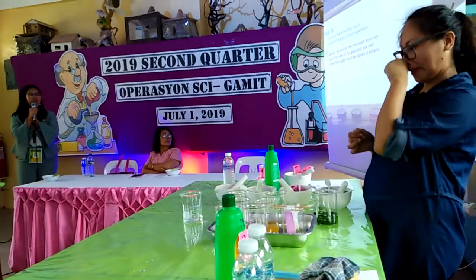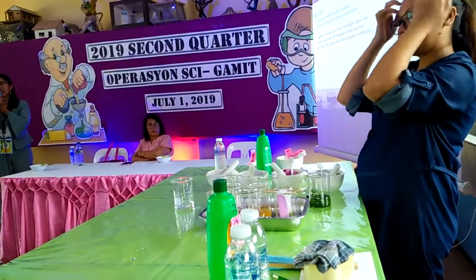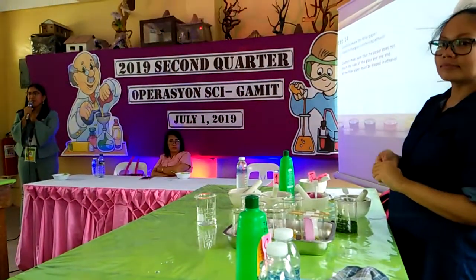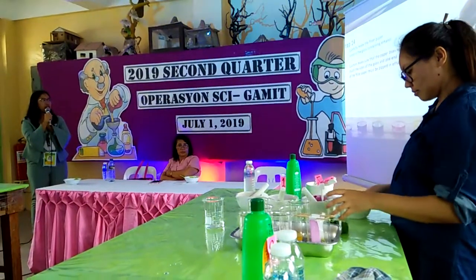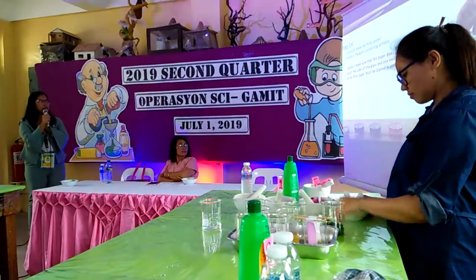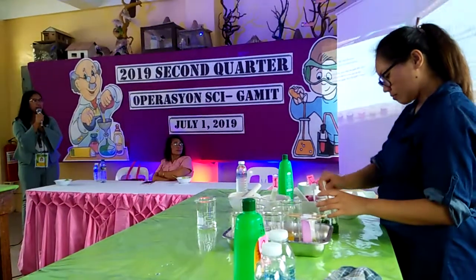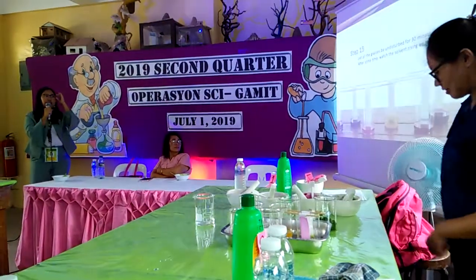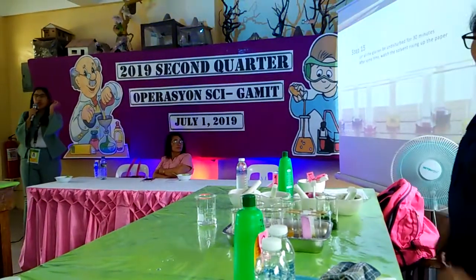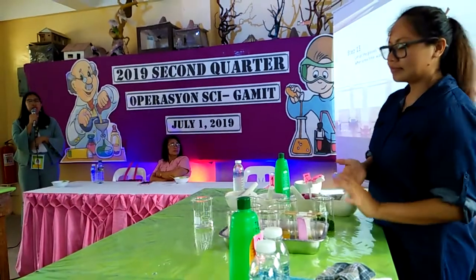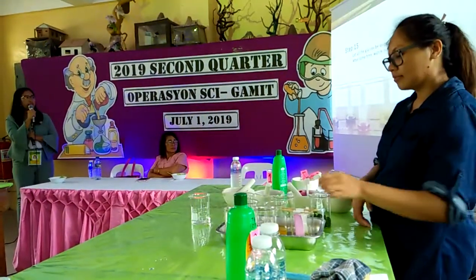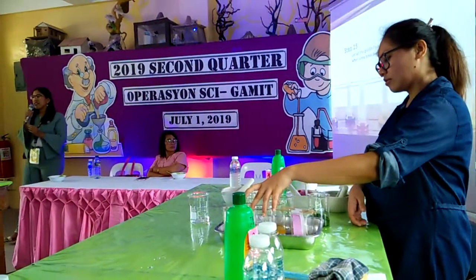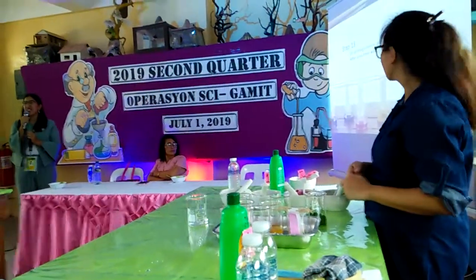Step fourteen: you're going to hang it — you can try on the tables. Step fifteen: you will give 30 minutes to watch the solvent rise on the paper. Fast forward to 30 minutes.